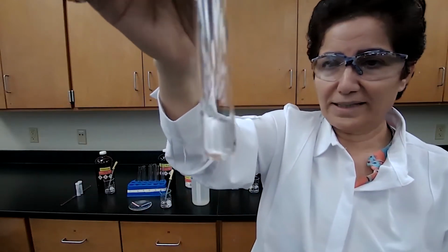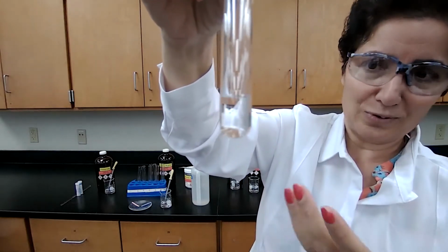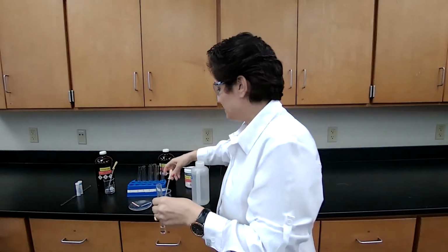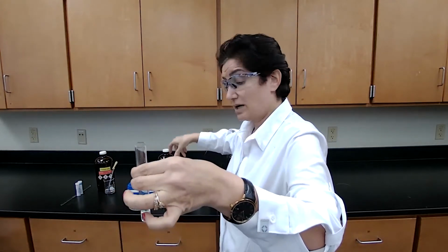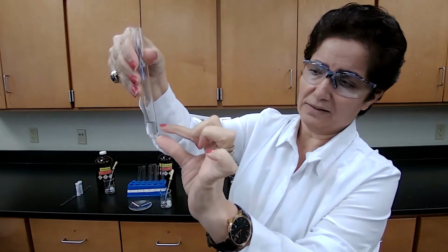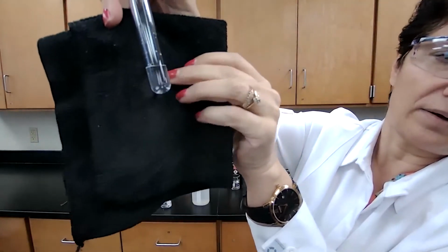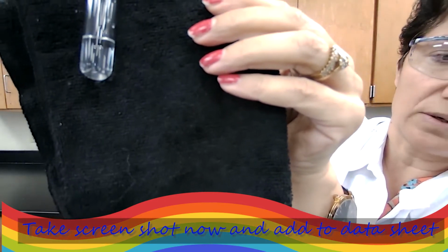It's not easy to distinguish whether you can see it or not, because it's 1 layer. When it's 2 layers, it's easier to see, but with 1 layer I have to work harder to make sure that you can see it. It's 1 layer, so it is soluble. When it's soluble with the first drop of the liquid, we can add more and try the solubility. If it doesn't dissolve, it's going to form a second layer, like an oily layer, and then the aqueous layer, in which case we can say insoluble. But ethanol did dissolve and we only have 1 layer. We're going to use the black background to see if it makes it better for you to see it. Yes, it's 1 layer, so it is soluble.